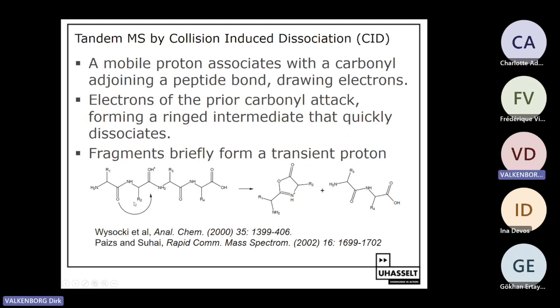How this exactly works, it's a semi-stochastic process, so it will not always break in the same way. For one peptide, it can generate a break over here. For the other peptide, it can generate a break at another position. So it depends a little bit. There is some stochasticity involved. By stochasticity, I mean that there is an act of chance involved with where it exactly would break.